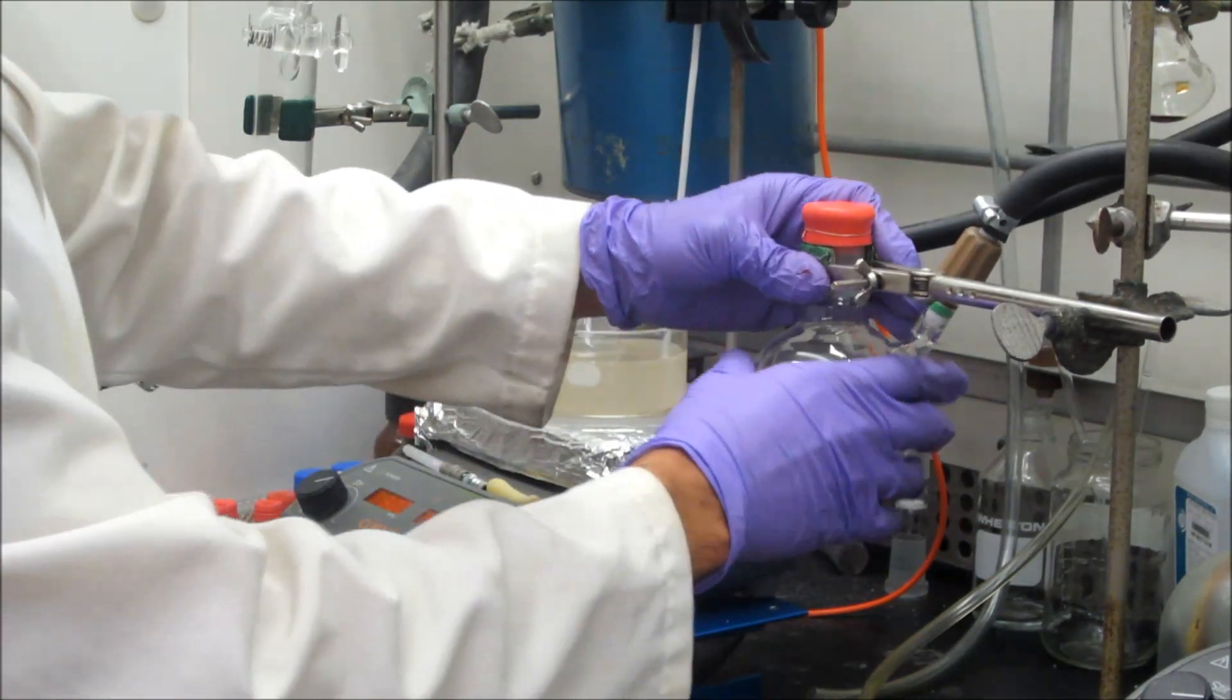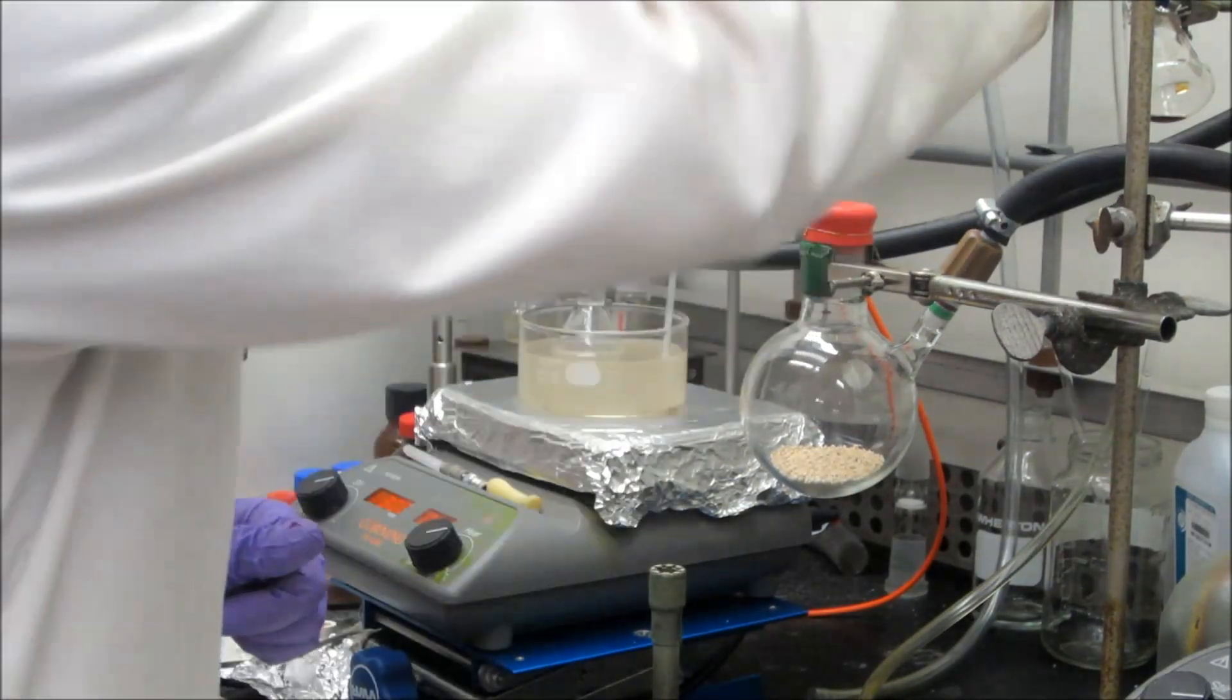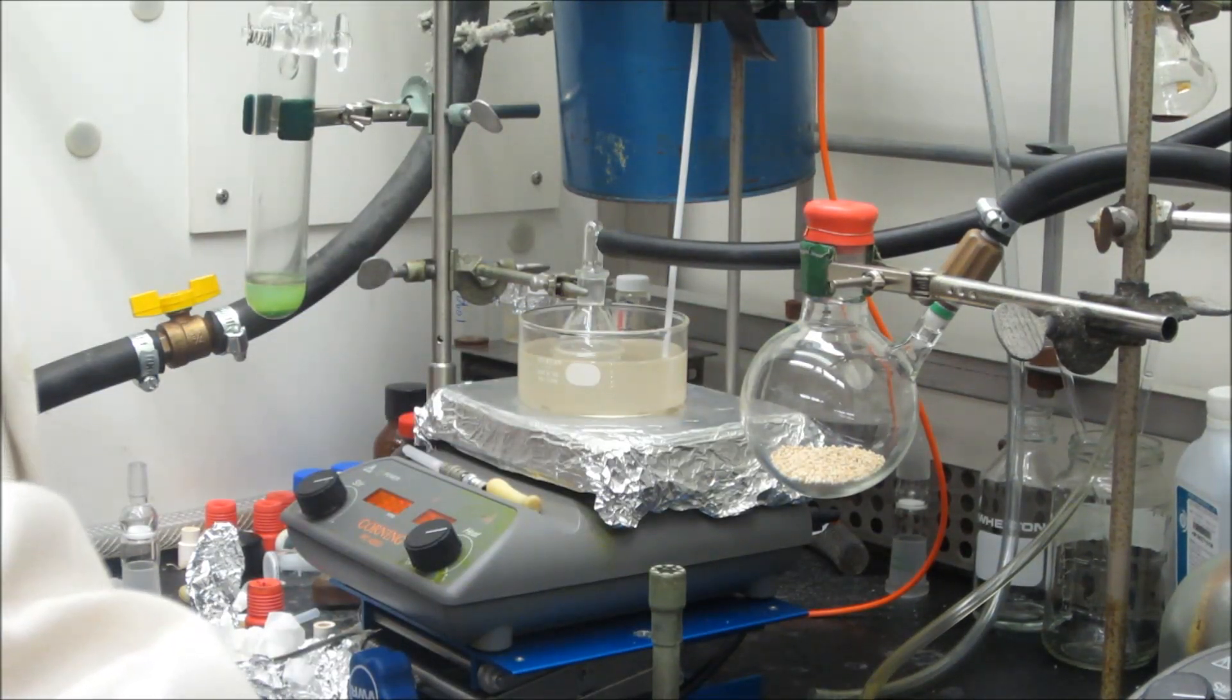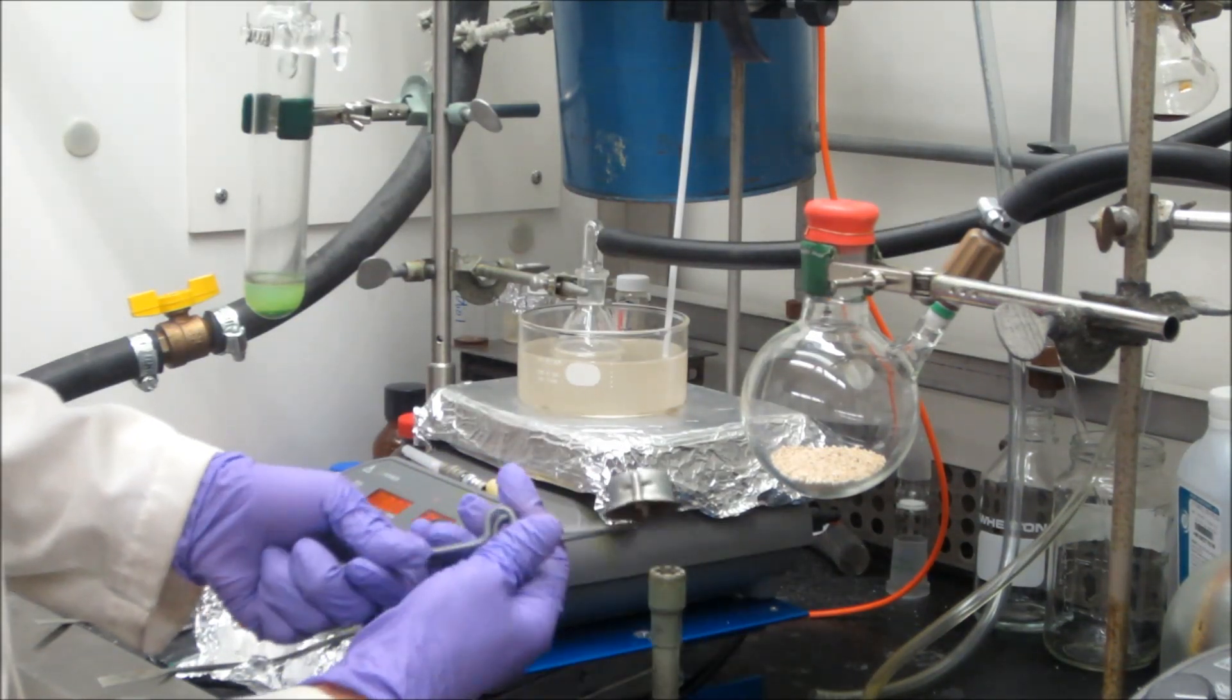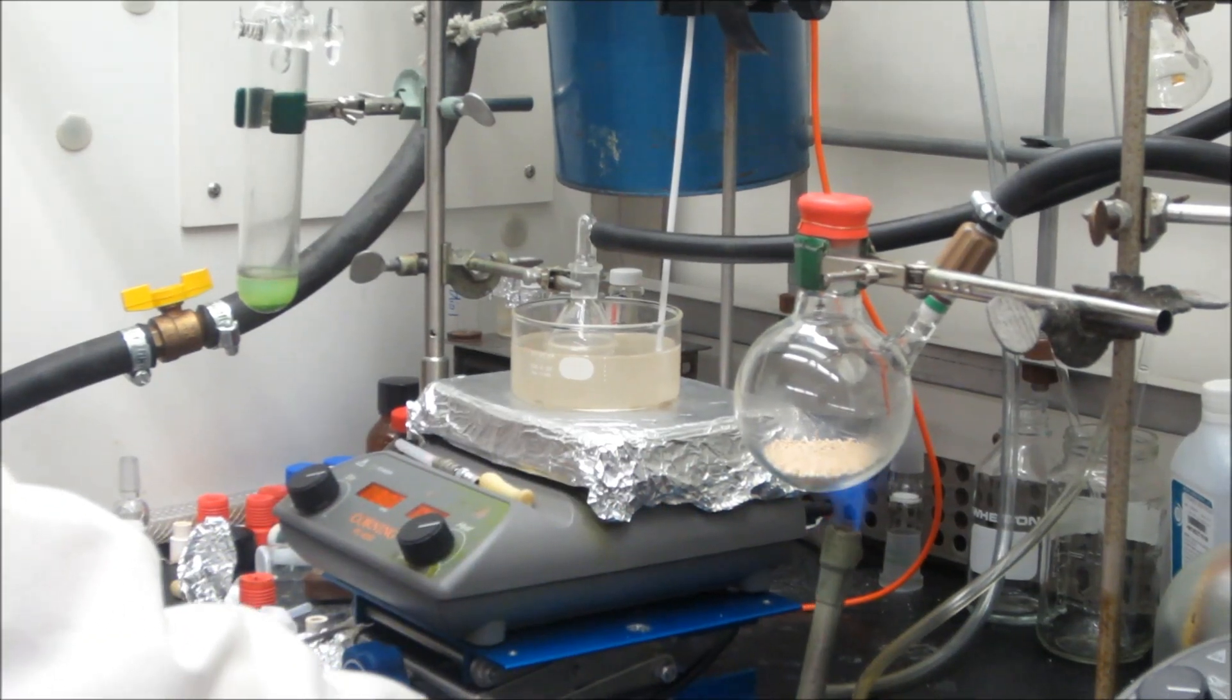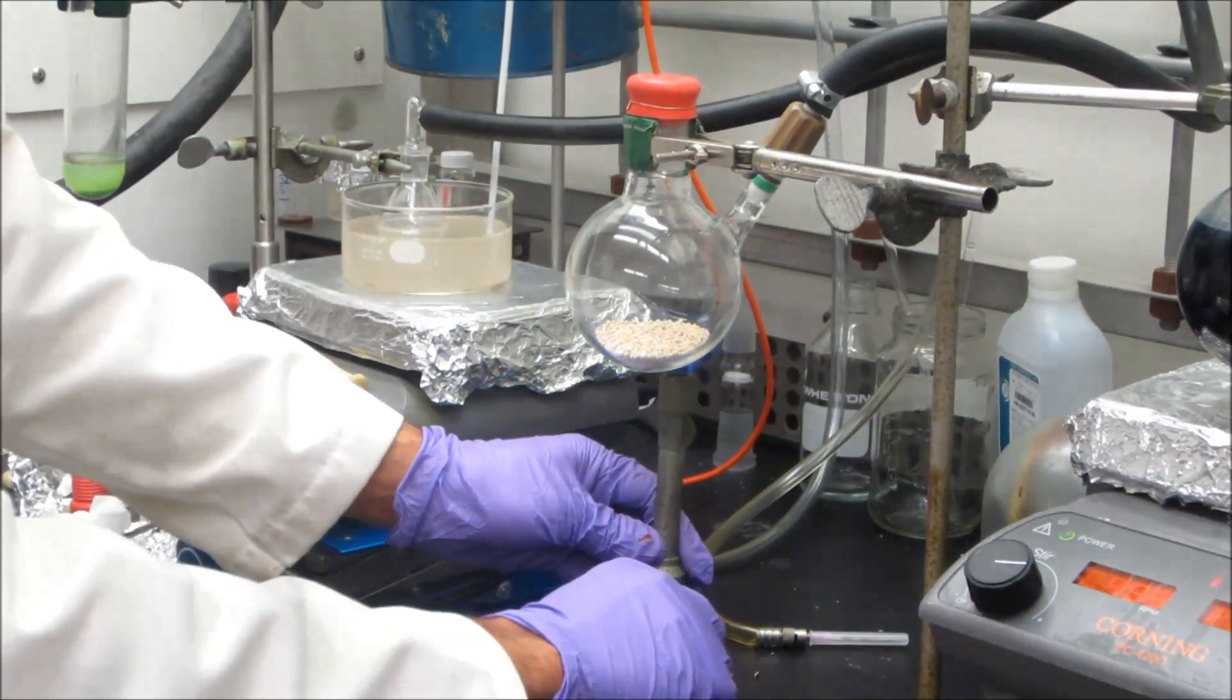And so the first thing that we do is make sure that everything is securely clamped. And then we open the system to nitrogen and we take a Bunsen burner and light the Bunsen burner and heat the bottom of the flask. Basically, anywhere there are sieves, you want to make sure that you heat evenly.